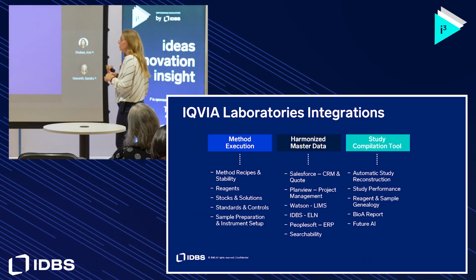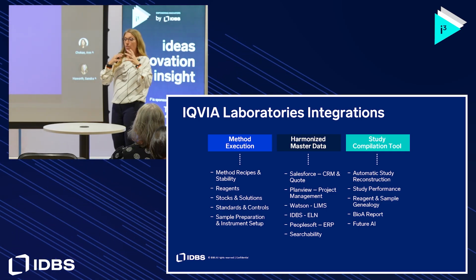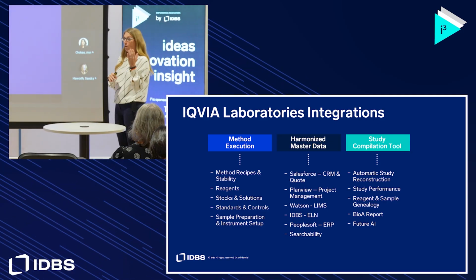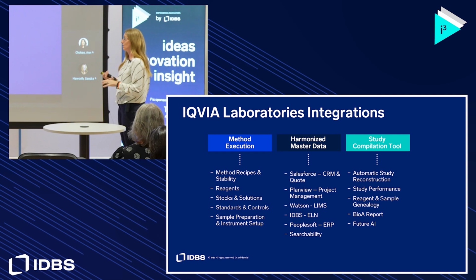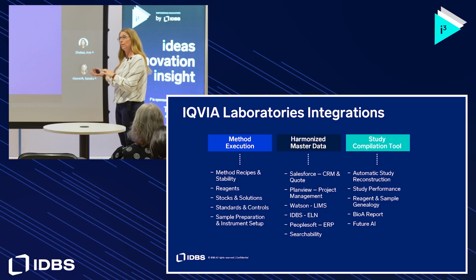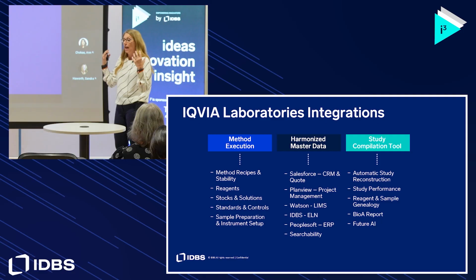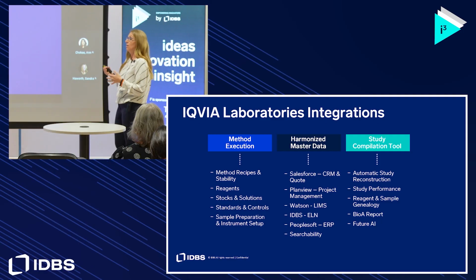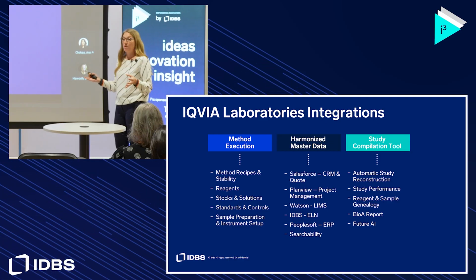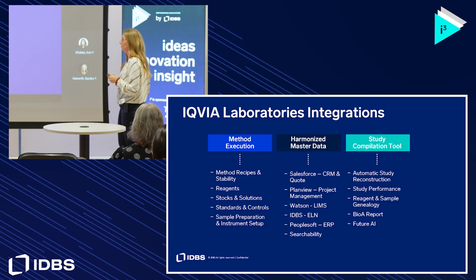The next integration to talk about is our method template. Essentially we have one experiment where you fill out every single method parameter. I mentioned that method template covers LCMS, LBA, PK, and ADA. Then we have our templates that the lab executes, and all they have to do is type in their method number and run a query, and everything about how to prepare the reagent, stock solutions, standards, controls, sample prep, how to set up your mass spec, and what instruments to use is provided to them right after they run that query.